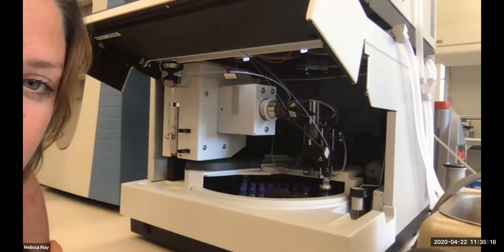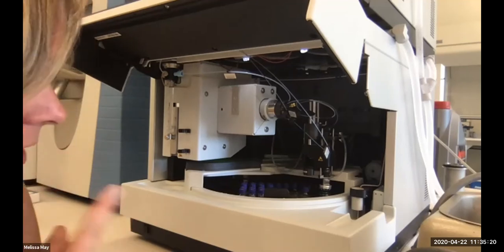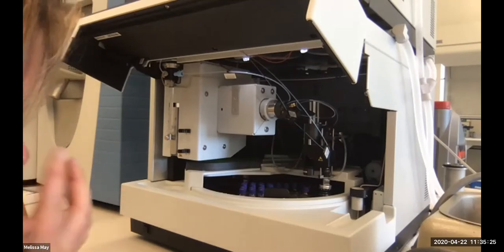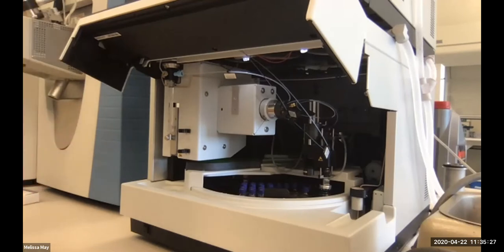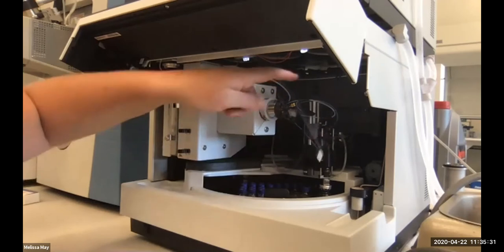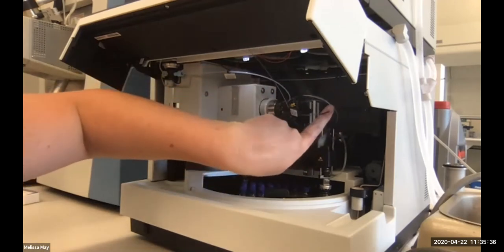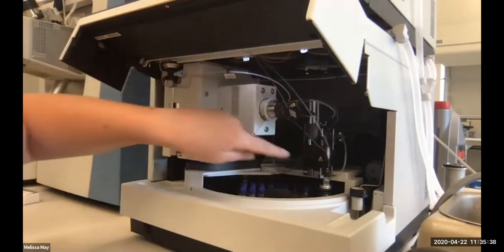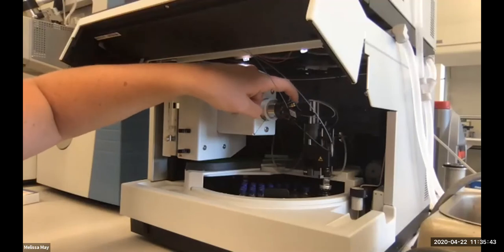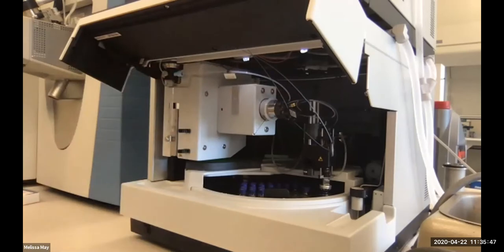And what's gonna happen is it's gonna inject 1 microliter of water, because that's what I have in GA3, with 19 microliters of this sample buffer into the instrument. And so this is all automatically controlled. The way that this works is kind of hard to see from here, but you have a 6-port valve that's sitting right here. This is picking up sample from our loading buffer and loading it into this tube. It's then going to go into, this is our column loop.